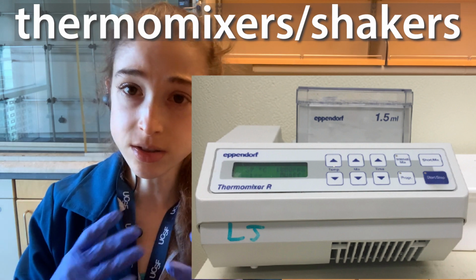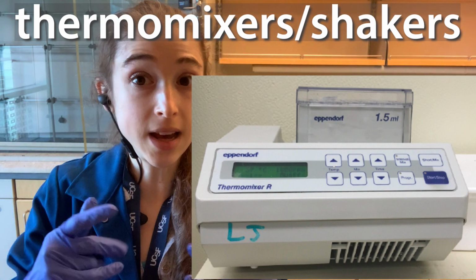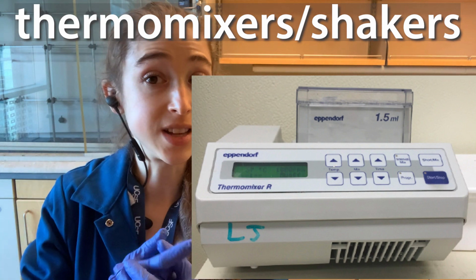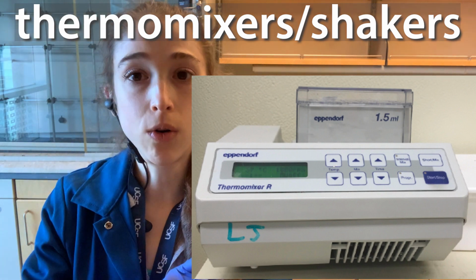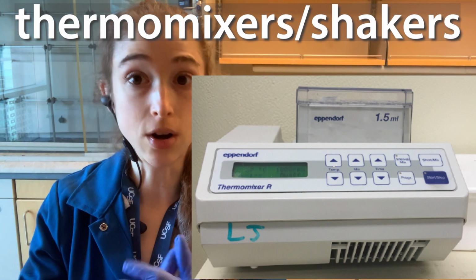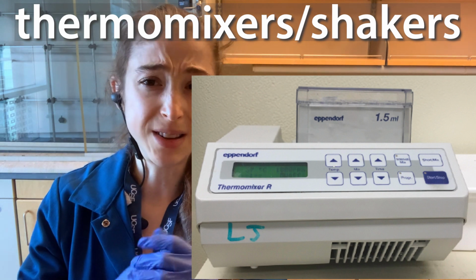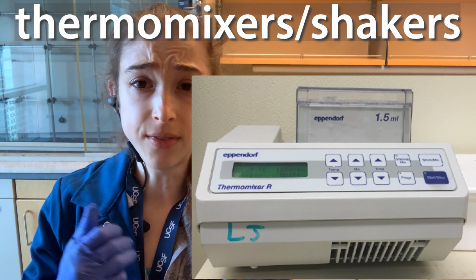These shaker blocks are also really good for a variety of other purposes, when we might need to be incubating at a certain temperature, when we have reactions that are bigger than a PCR tube, or we need something that's shaking. Those thermal shakers are really great for that. I highly, highly love them.